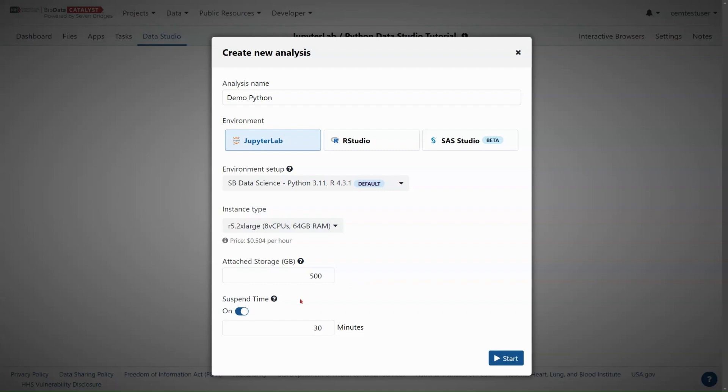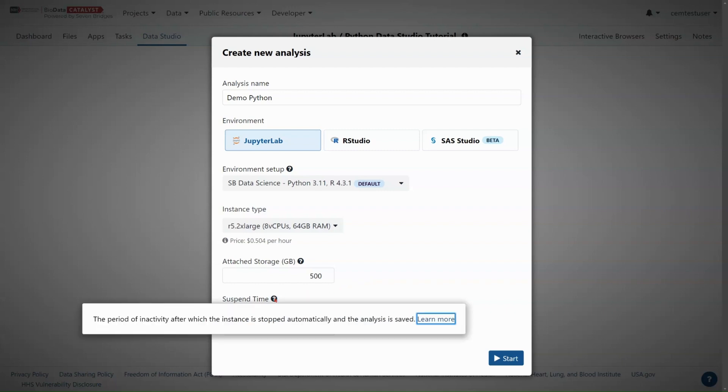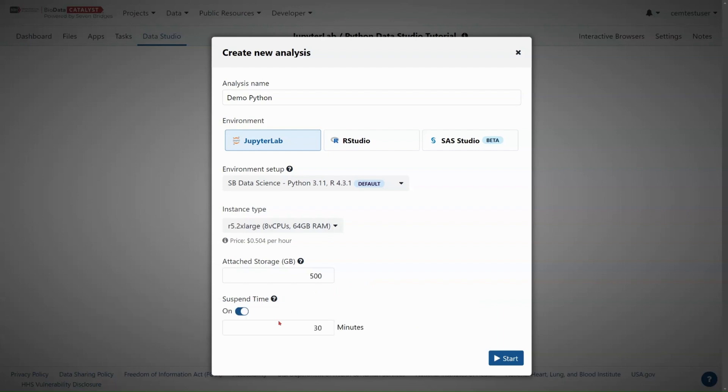And then the last option here is the suspend time. Clicking the tooltip, I see the suspend time is the period of inactivity after which the instance is stopped automatically and the analysis is saved. We do not recommend turning off the suspend time. You may set the suspend time for as long as 120 minutes, but this is a cost guardrail. After 30 minutes of inactivity, this session will gracefully stop and save my space.